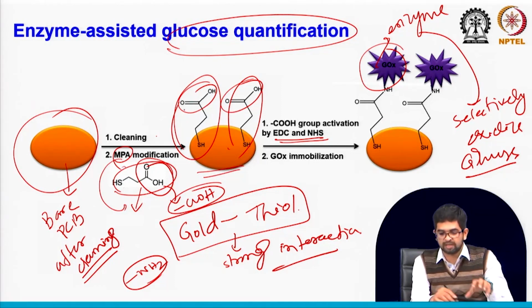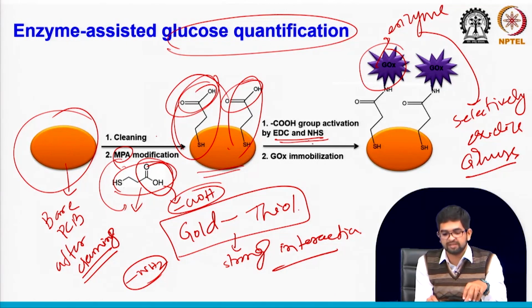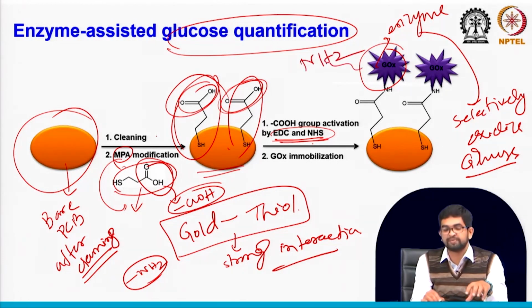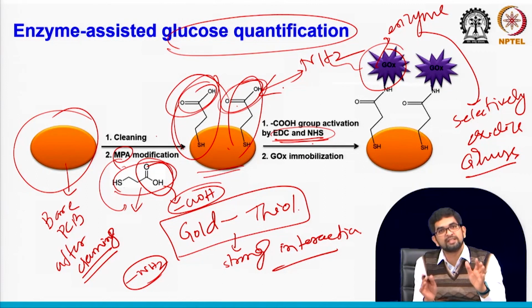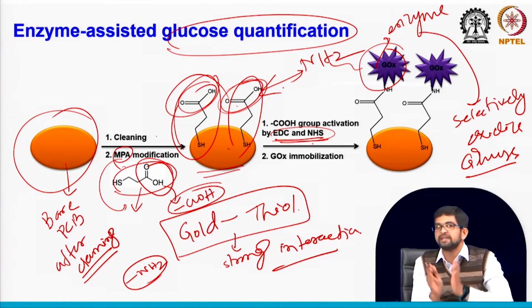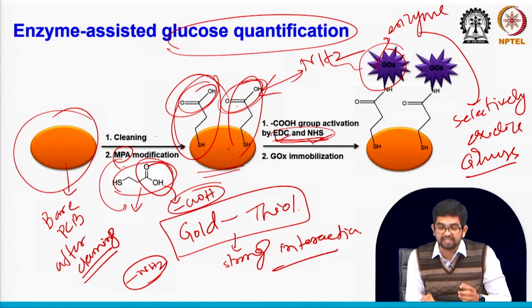First you bring the carboxylic group onto the sensor surface, then you activate this carboxylic group with EDC-NHS, because this is just a catalyst. It can activate this carboxylic group. See, glucose oxidase has free amine groups. So carboxylic group and amine group can bind and form an amide bond. Thermodynamically they are fine, they can react, but kinetically they are very, very slow. So how can you make the reaction faster? For that you need EDC-NHS.